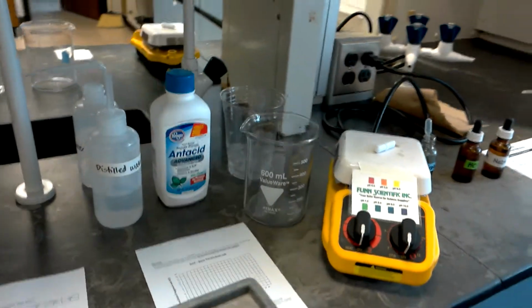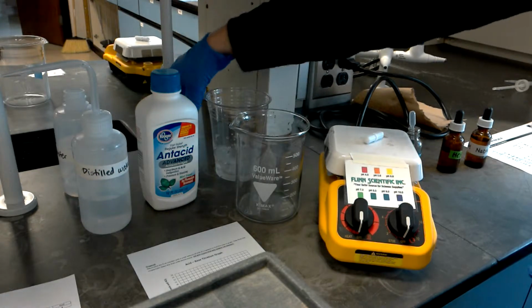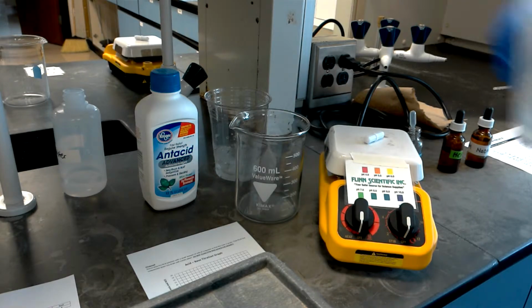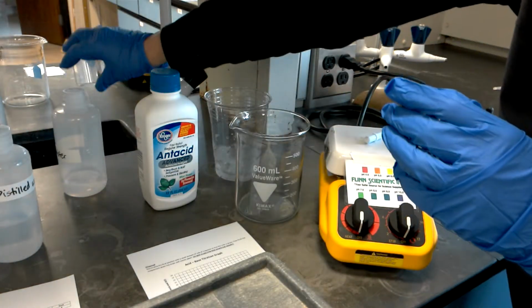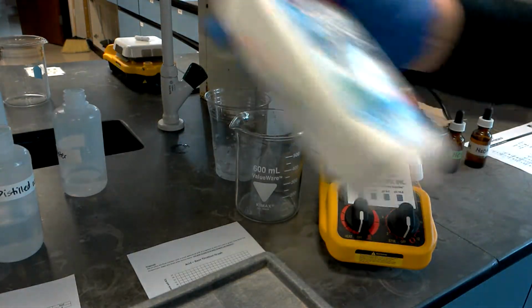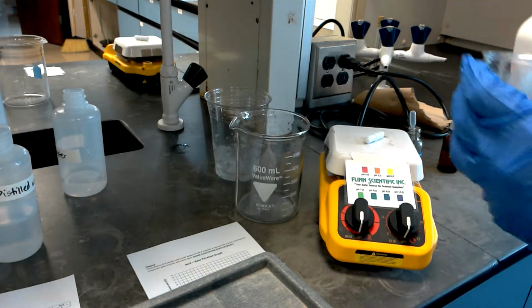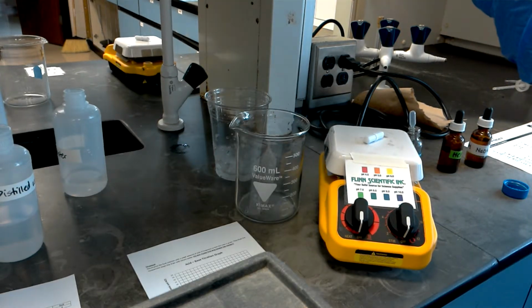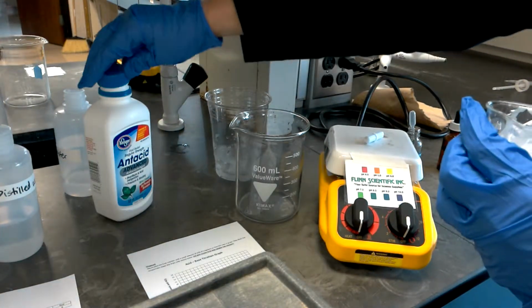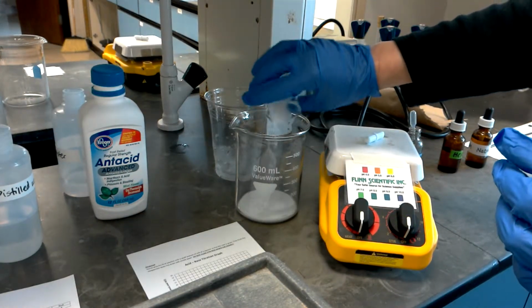So we're going to get started with the procedure. The first thing the procedure asks you to do is to take the small beaker and rinse it with distilled water so that whenever you add the antacid, the milk of magnesia, it will pour out more readily. You want to shake the milk of magnesia before you get started so that any settling out that might have occurred will be thoroughly mixed. It's not really a precise amount, but about 10 mils is what we're asking for.